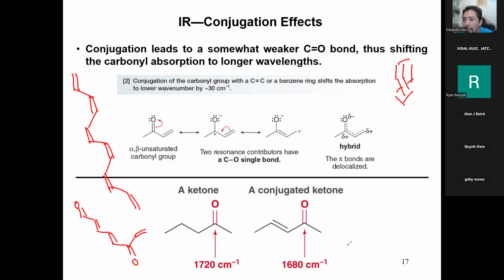Now, I had a quick question. It says, does the fingerprint region always start at 1500? No, no. I think the fingerprint region starts at 1000 and below. Other people will tell you 1200 and below. Some people will tell you 1400. As a rule of thumb, I would say anything below 1200 is fingerprintish. But really, 1000 and below is pretty much for sure fingerprint. So, good question.